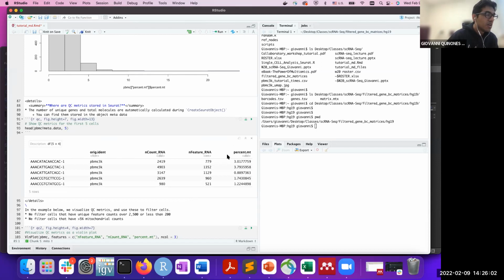You don't see, are you talking about the histogram? Oh yeah, I'm sorry. I sent the extra line of code to one student only. I'm sorry. Okay, this should get to everybody. Yeah, thanks, Brian.